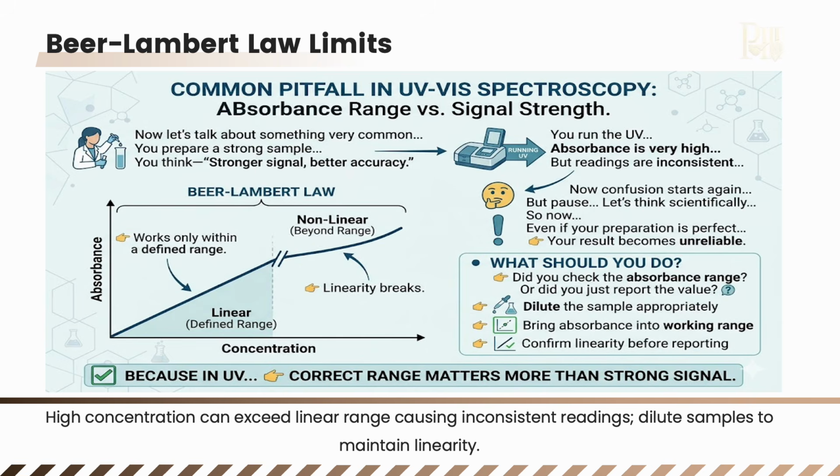Beer-Lambert law. It works only within a defined range. Beyond that, the linearity breaks. So now, even if your preparation is perfect, your result becomes unreliable. Now ask yourself, did you check the absorbance range or did you just report the value?